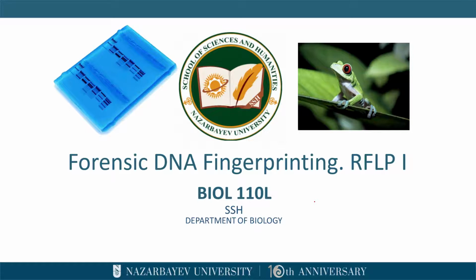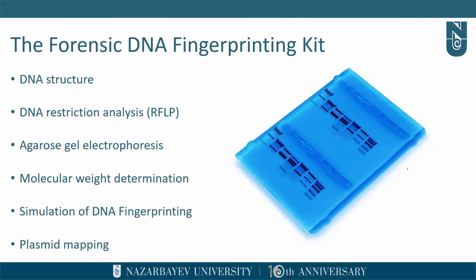Hello everyone, so today we have the first part of the lab lecture, and it is about forensic DNA fingerprinting. What we are going to talk about is, first of all, that we are going to use a special kit, with all needed materials and substances supplied with this kit.